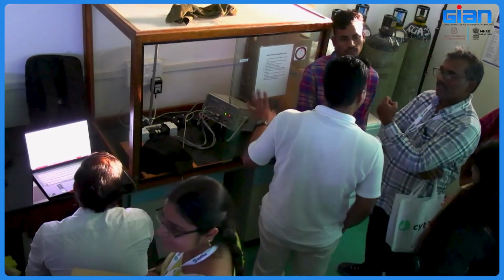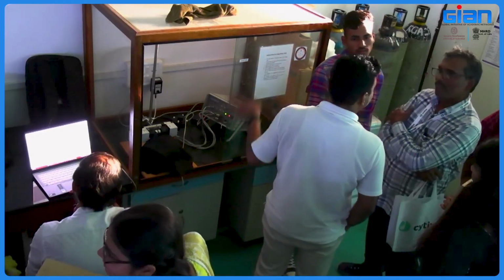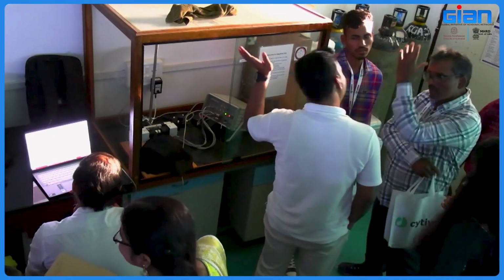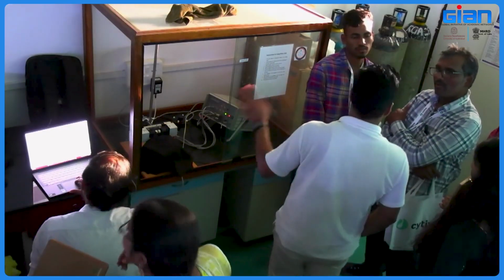Okay, but whether it is giving the actual results, the interpretation, is any calibration required or not? It is already calibrated. Recently, in January, February, we sent it to Germany. Calibration is not done here. We have to send it to Germany, and they send it back. It took 2-3 months. So it is already calibrated.